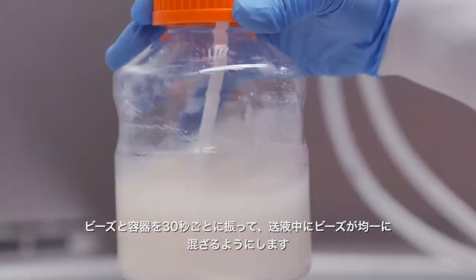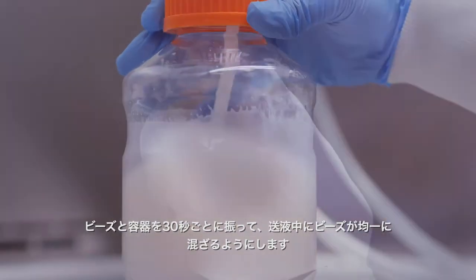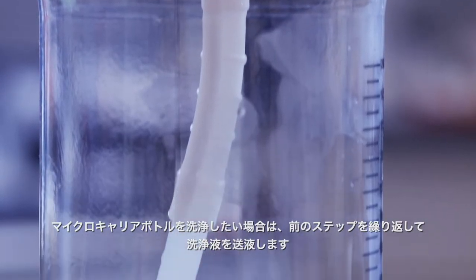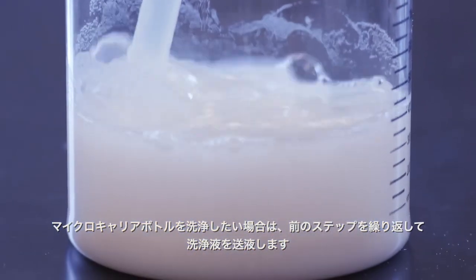Turn on the pump to transfer the slurry. Keep shaking the beads and the vessel every 30 seconds to keep the beads homogeneously mixed during transfer. Close the clamps after the appropriate volume has been transferred. If you would like to rinse the microcarrier bottle, repeat the previous steps to transfer the wash.